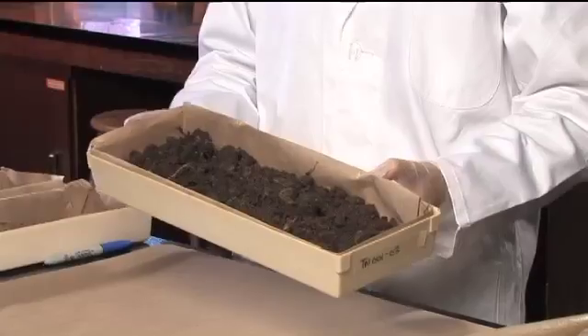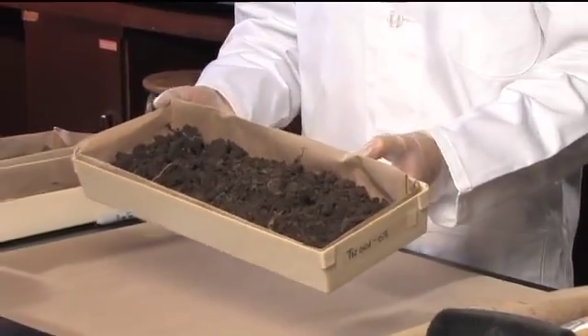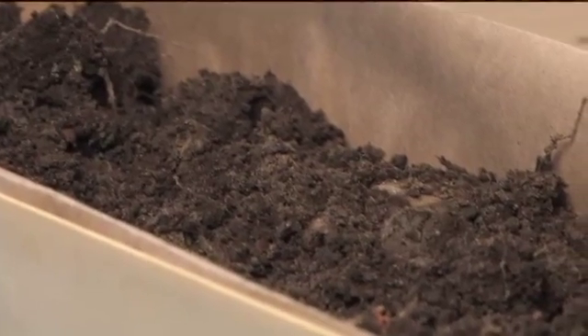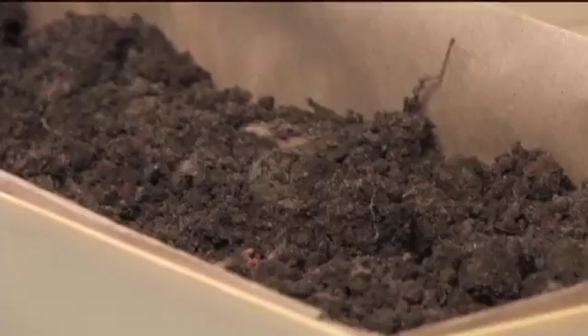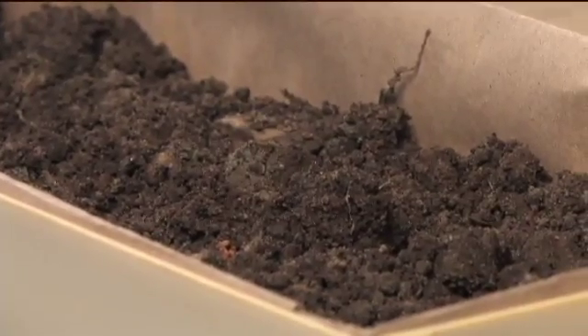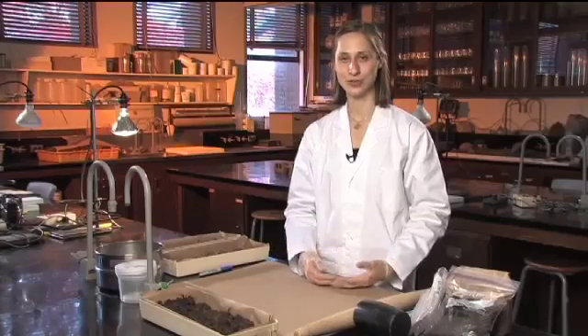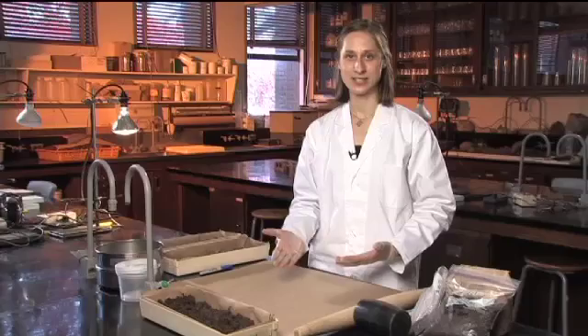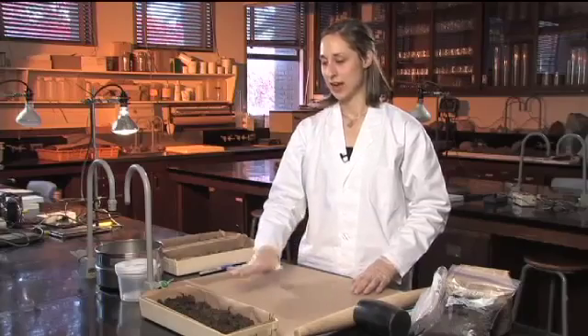Spread it out in a fairly thin layer and lay your trays out in a cool dry place where there won't be any cross-contamination. How long it takes to air dry can vary depending on your sample and how moist it is. It might be a few days or it could be over a week, so keep checking back until you're sure the sample is totally dry. You don't want to try to speed that process up with ovens — just leave it out at air temperature.